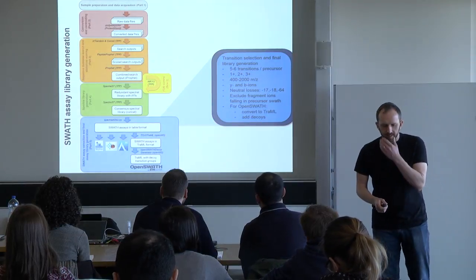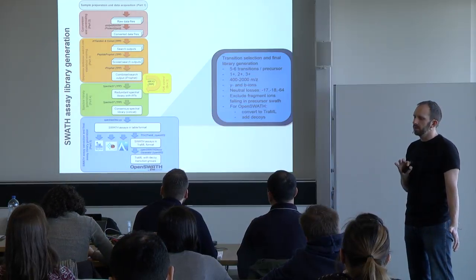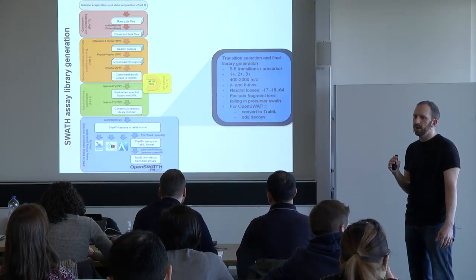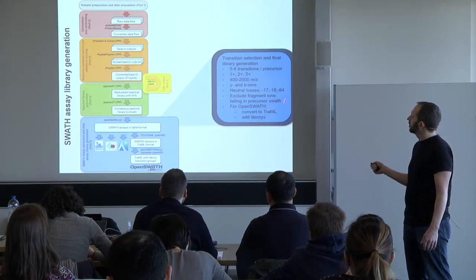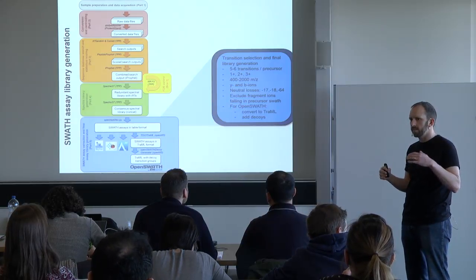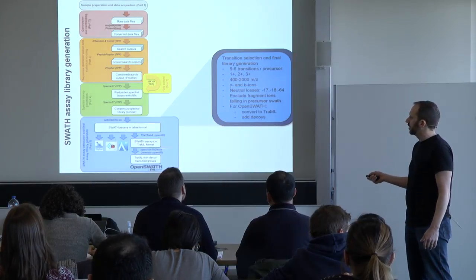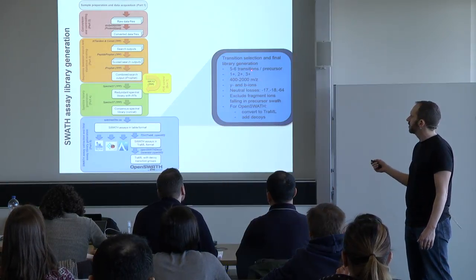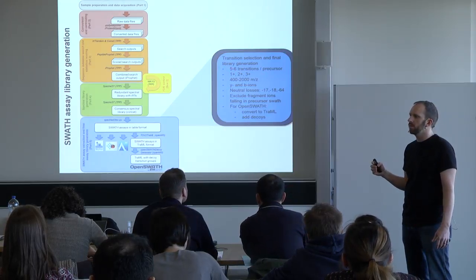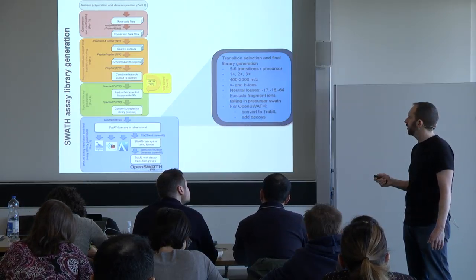And then the final step is to go from the spectral library to the assay library, which is the nomenclature that we use. So to go from a spectrum to now just a table, a list of fragment ions that you're going to monitor. You need a set of rules to choose which fragments. These correspond to the rules in the peptide settings and transition settings tabs in Skyline, but we're actually doing this with a script. It's the same thing. What we recommend is 5 to 6 transitions per precursor, based on the data that Ludovic showed in the mProphet analysis.